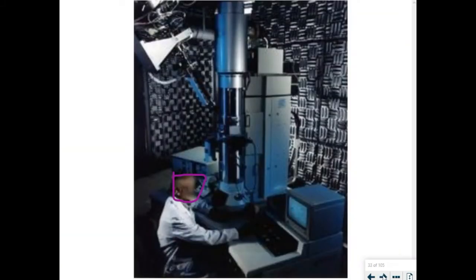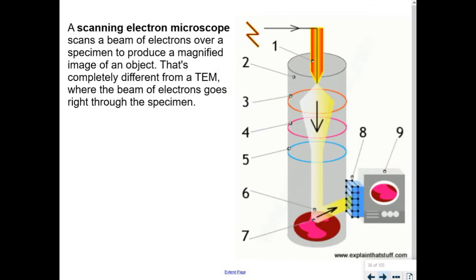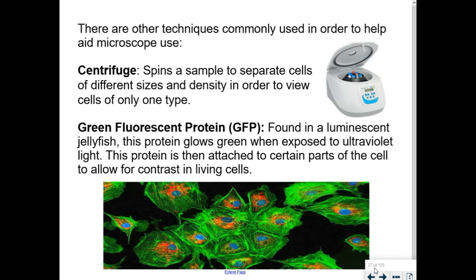Okay, I think I've talked about all these slides here. Okay, here's our last discussion topic that I've got for you for notes to write on here. We want to talk about some other techniques that scientists have for being able to get a good, clear image with microscopes. I've already discussed one with you. It's the technique called staining. If you add a stain or a color or a dye, you can see your clear, colorless cells better.